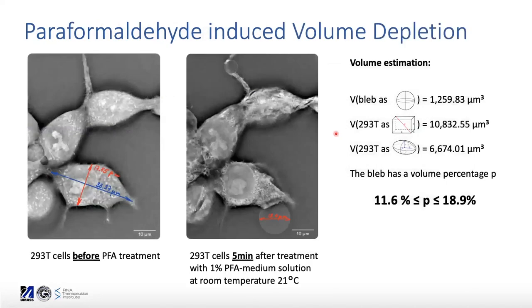The next slide shows fixation with paraformaldehyde where I computed the volume of cells and the volume of the blebs shown, estimating that in this case the blebs have a volume percentage between 11 and 19 percent of the cell. I have to admit that's an extreme case, even though I used just 1% paraformaldehyde added to the medium. Since paraformaldehyde or formaldehyde will sink to the bottom, the actual concentration at the cells will be much higher than that 1%.